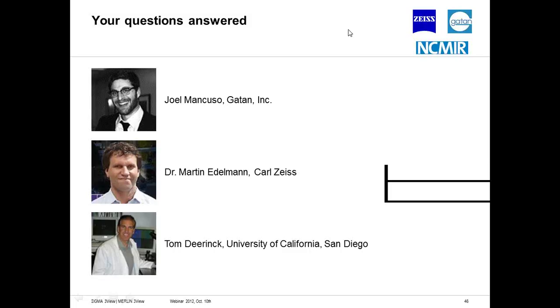The more tolerant the resin is, the longer you can dwell the beam, or the more dose you can put on your sample per pixel, and your signal to noise will increase, and your resolution can actually increase as well. So I think the 2 real exciting areas are the resin and the sample preparation concerning high pressure freezing.